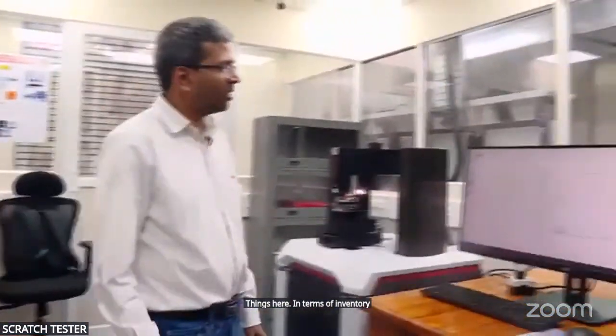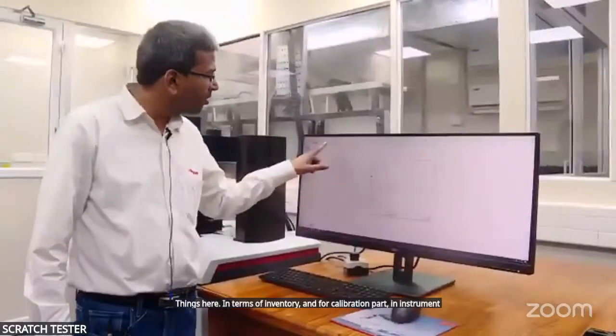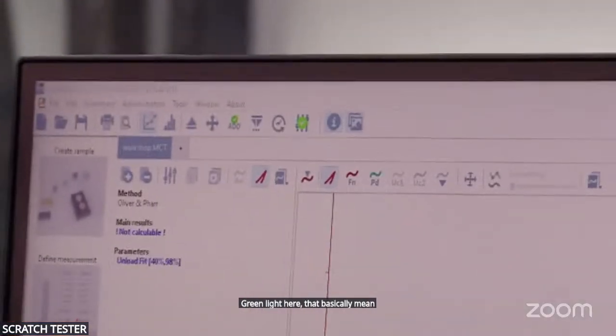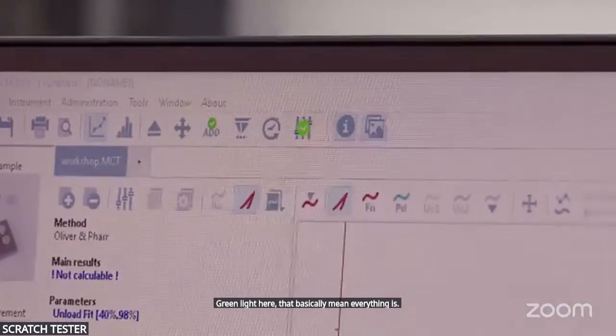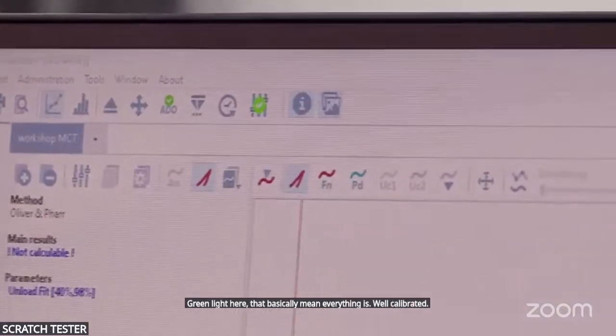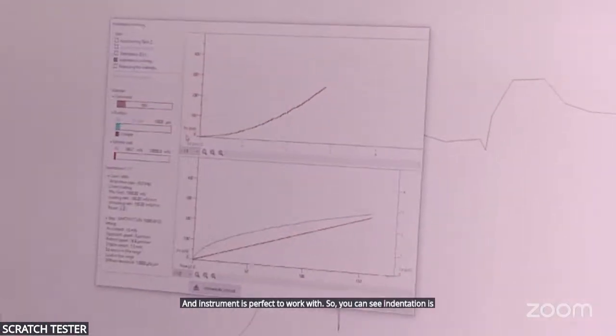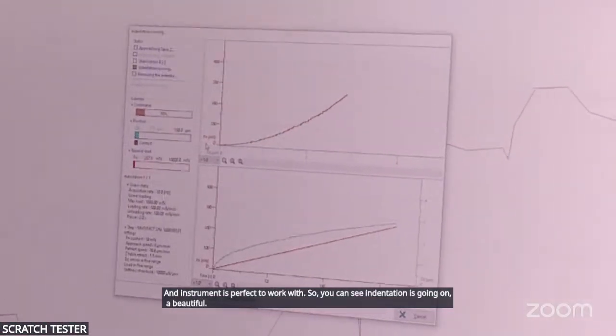And for the calibration part in the instrument itself, the software also tells you that everything is calibrated. When we see this green light here, that basically means everything is well calibrated and the instrument is perfect to work with. So you can see indentation is going on, a beautiful curve is coming.